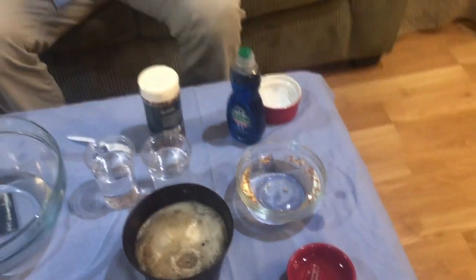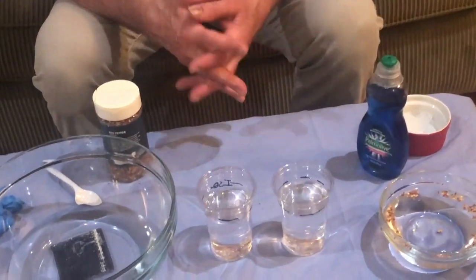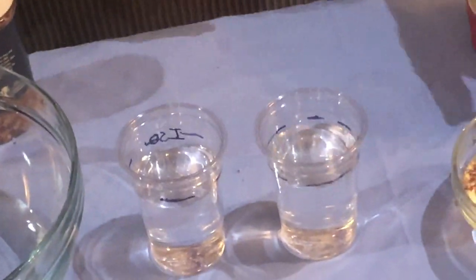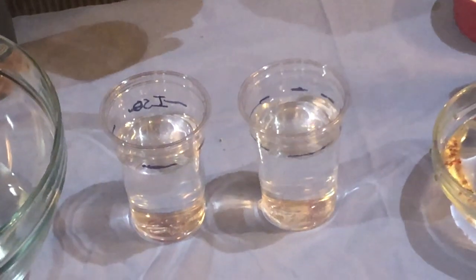I was also showing you alcohol in water. Now, how many particles there are isn't really in the lesson, but you should keep this in mind. We might do some math on it coming up, but how many particles there are in water is part of the density of the water. So I've got water and isopropyl alcohol here, and I tried to put the same amounts in. They're pretty darn close, so they have the same volume. They take up the same amount of space.